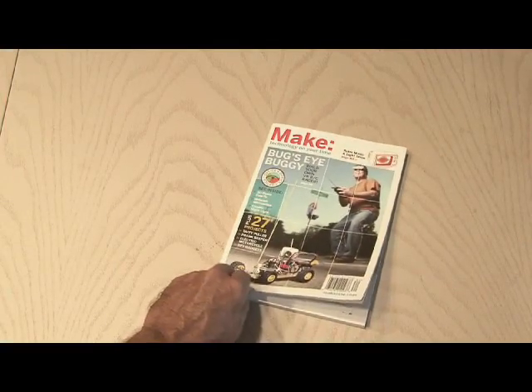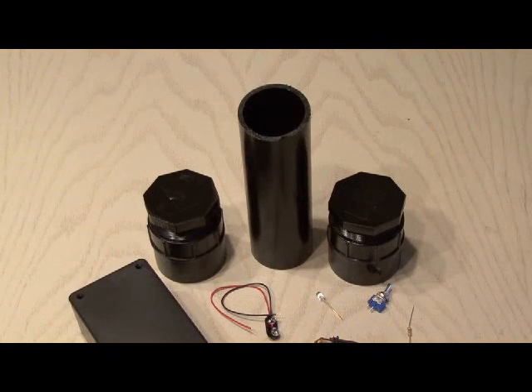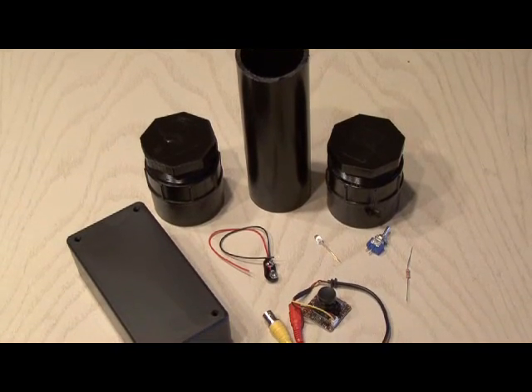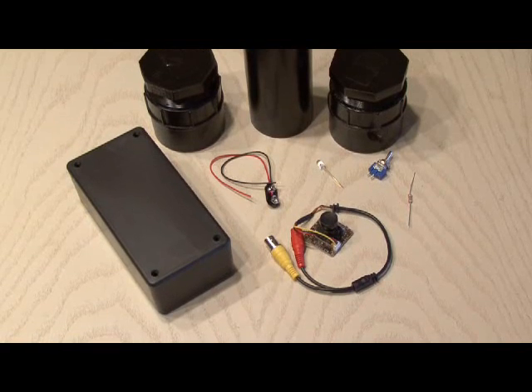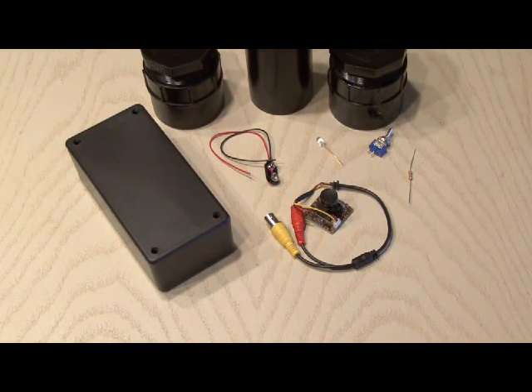You'll find the lensless microscope in Make Volume 14, page 64. The main components are a mini CCD monochrome camera, a 9-volt battery clip, a single-pole single-throw switch, a 3mm or 5mm LED, a 1K resistor, a project box, and some 2-inch PVC pipe and caps.